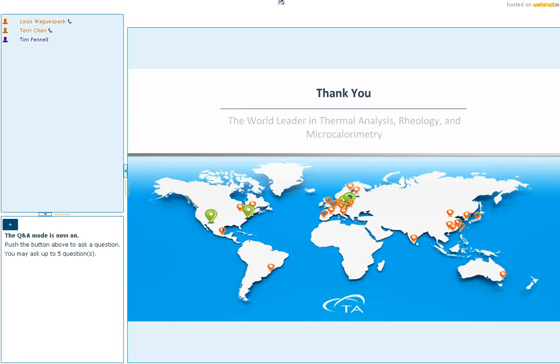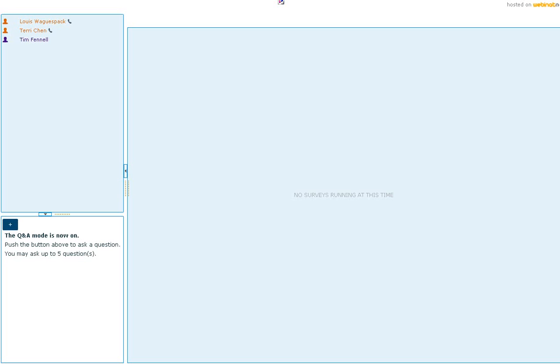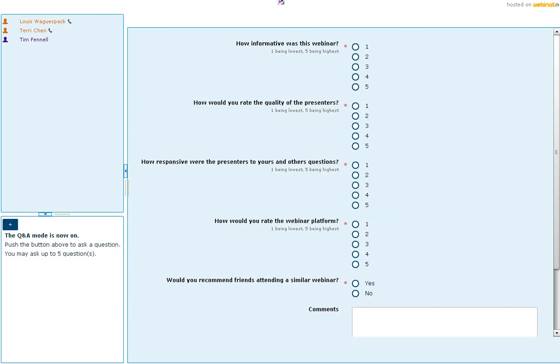So the next one: why does the crossover modulus value change with curing isothermal temperature? I understand that time will change, but not sure why the modulus crossover value changes. That is because of your measurement frequency. The modulus measured at different frequencies actually correlates to the sample material's relaxation. The higher the measurement frequency, the more the sample's relaxation will have a challenge to follow the oscillation. Therefore, the sample behaves stiffer, so the modulus will show higher. That's why, as you use higher measurement frequencies, the modulus shows higher values, and that's what you see from the measurement results.